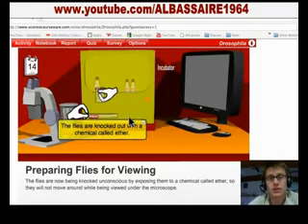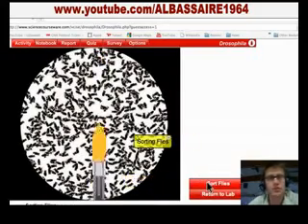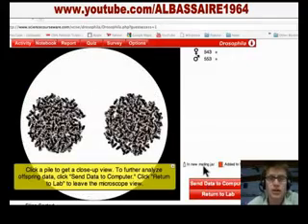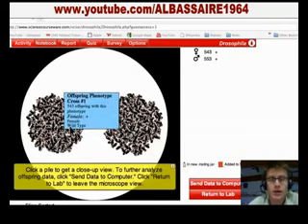So it was a female of the wild type and a male of vestigial wings. We now put them underneath that microscope, and then we sort the flies. They would be asleep at this point, and then we're going to sort them out according to gender. And it could also be any other phenotype. But if we look at our two piles here, we have 543 offspring that are female wild type. And then over here we have males of wild type as well. So it looks like we have an equal amount of each. Now that would be the F1.